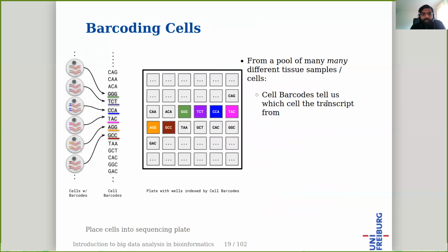And now let's look at barcoding, the next step that differentiates single cell RNA sequencing from bulk RNA sequencing. What is usually done is that RNA is extracted from all the cells, and then all of it is put together and sequenced. That's what we usually do in bulk RNA sequencing, right? In this case, we cannot distinguish which transcripts are coming from which cells.